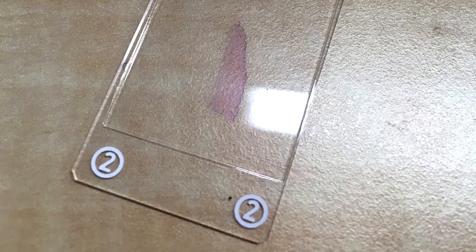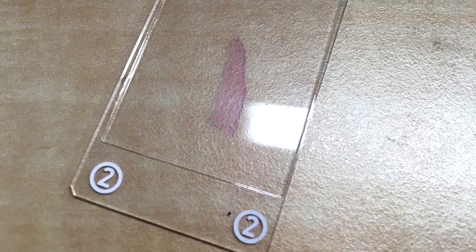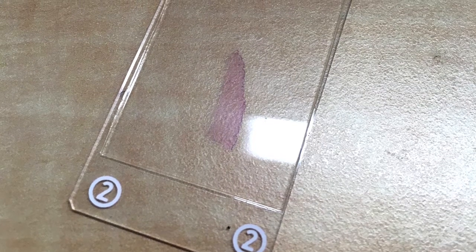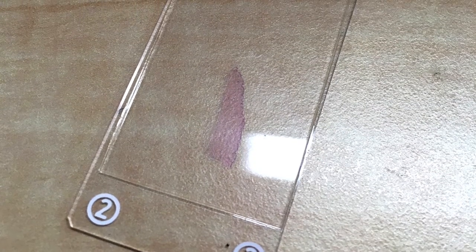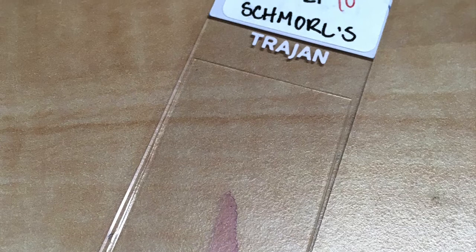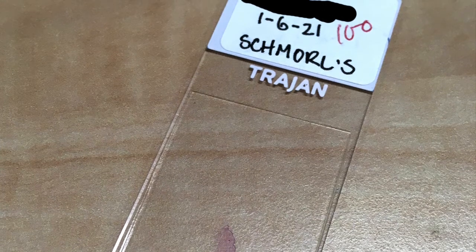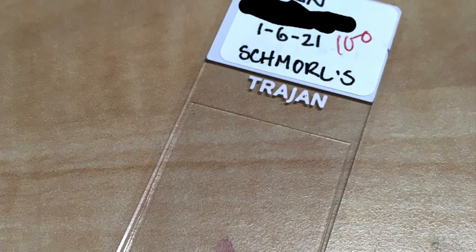Then in time, having had a bit of practice with this technique, most students will be able to fairly routinely achieve an outcome such as this one. This is a slide that was cover slipped during the final staining exam last semester, and you can see there's no mounting media on top of the slide, importantly nothing on top of the specimen itself, and there's just the right amount of mounting medium filling the rest of the slide, and it's not drifting off to the side. So that's ultimately what everyone's aiming for each time, and in combination with some really good staining on this occasion for melanin using the Schmorl's technique, this student was awarded 100%.